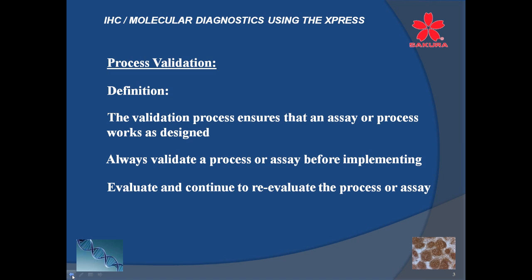I'm not saying we as individuals haven't, but we haven't had this preciseness that we've had to deal with until we have begun validation processes, whether this be for H&Es, special stains, immunohistochemistry. So it's something we're really getting used to, and for those of us that's been around a while, it's a process that we're having to really work with.